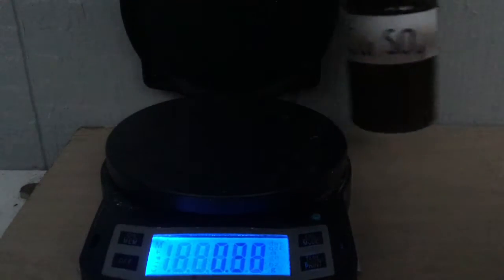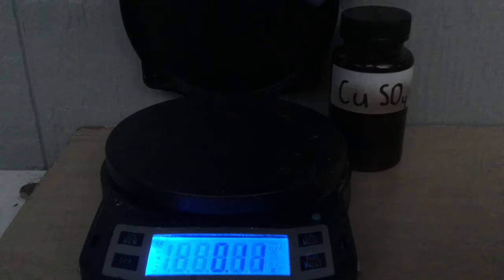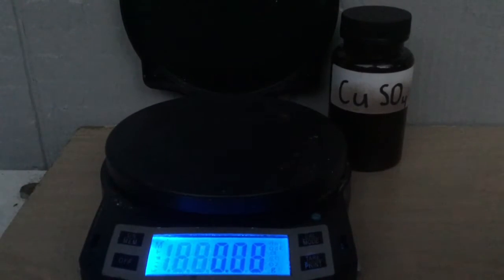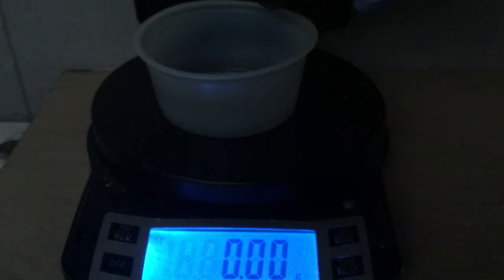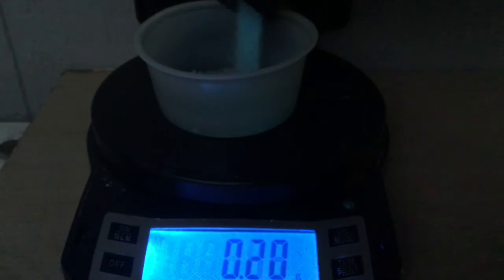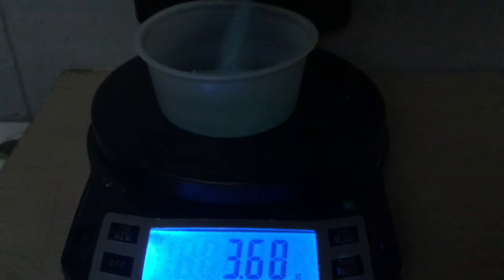We're just going to weigh out a set amount. Let's do 20 grams — actually, maybe not 20 grams. Let's do 13 grams.